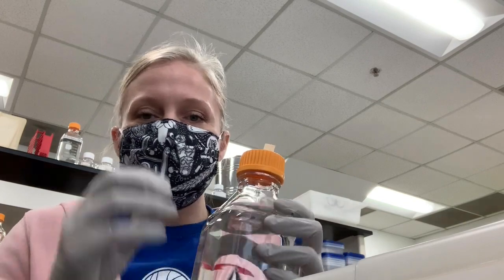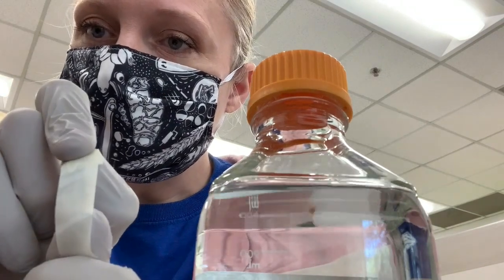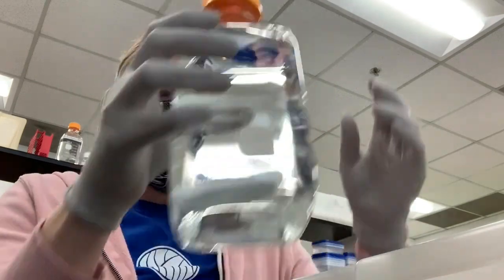The other thing you want to do is add some of this tape. So this is just a piece of autoclave tape. It has little stripes on it like this. And I put this on the lid or on anything else that I'm autoclaving to make sure that it is autoclaved. So after autoclaving, those stripes will turn black and let you know that the autoclave has worked. If there were some kind of malfunction in the autoclave, you would know because those stripes would not appear dark.